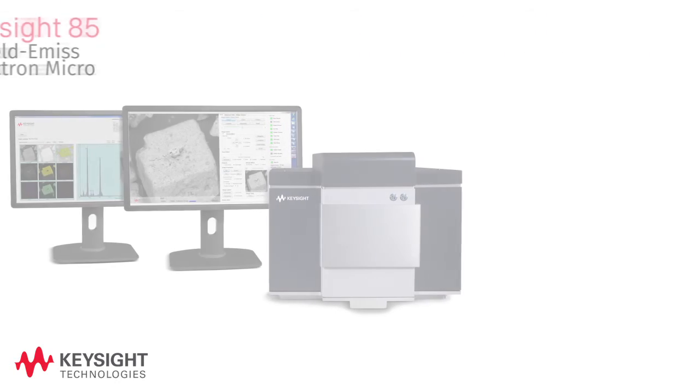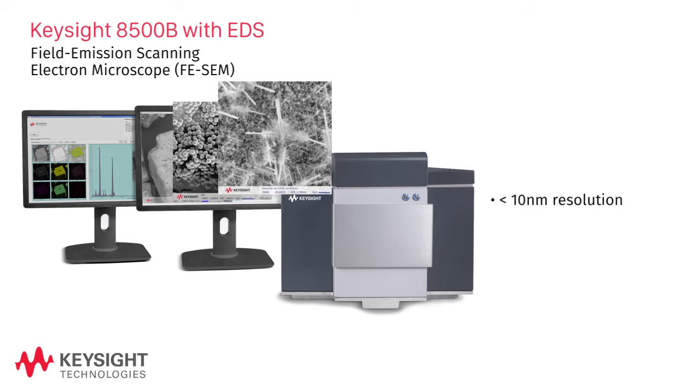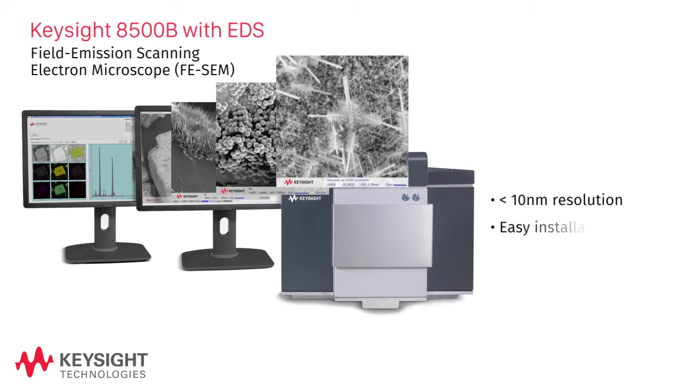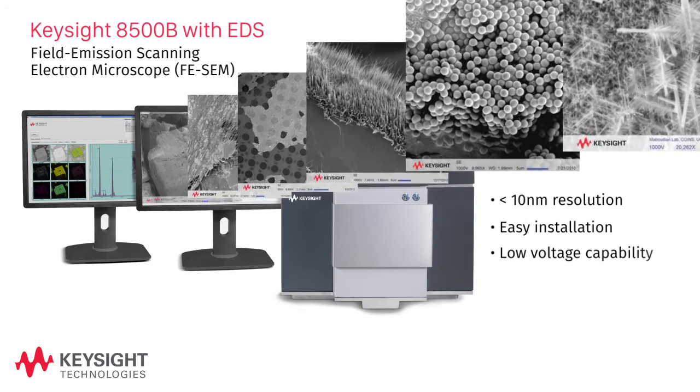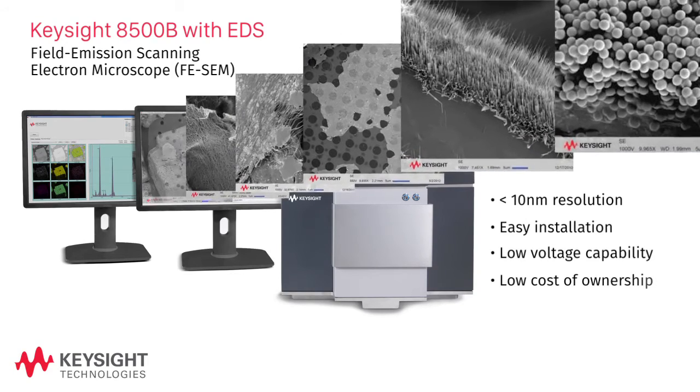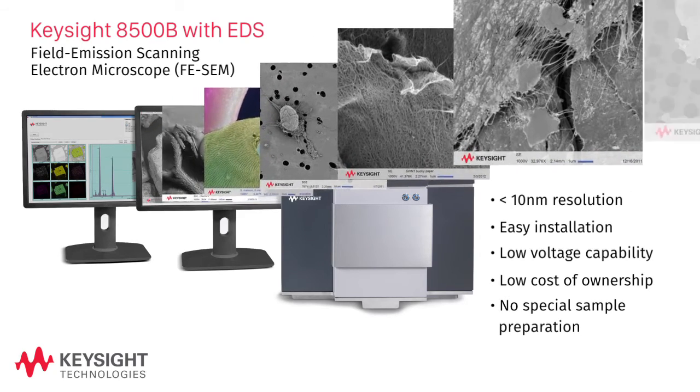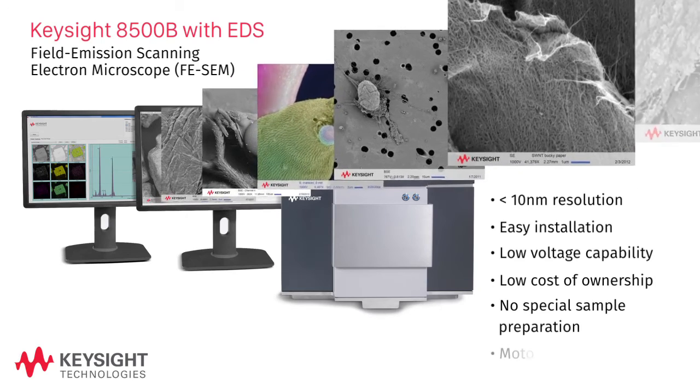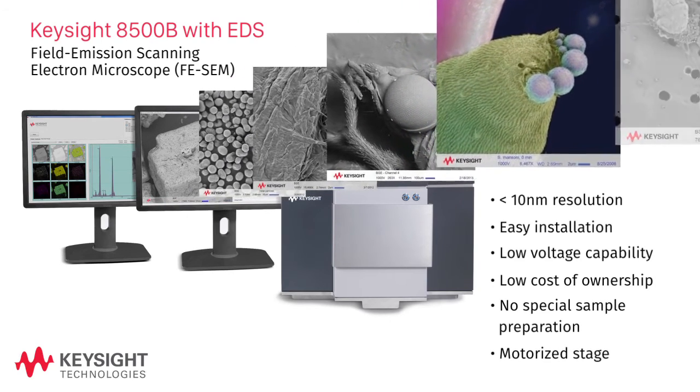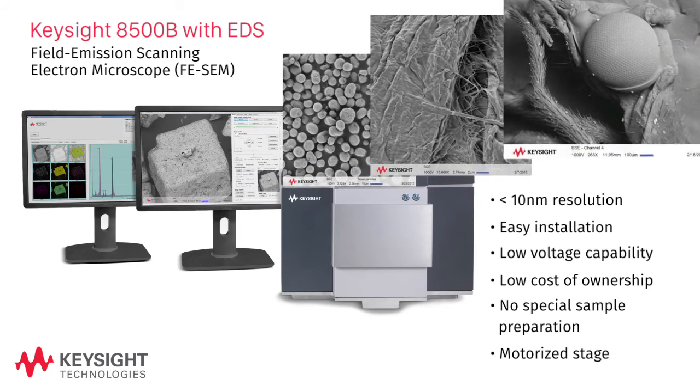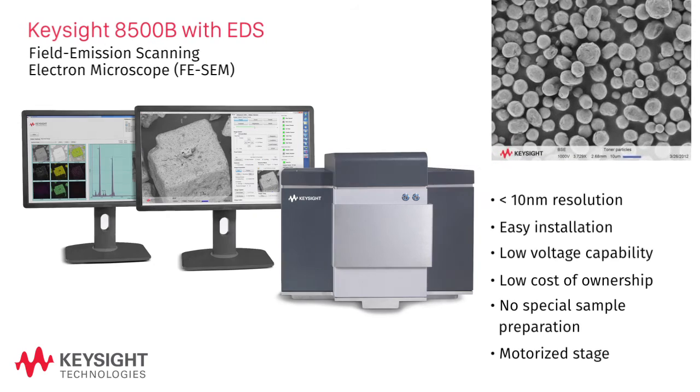The Keysight 8500B Compact FE-SEM offers less than 10 nanometer resolution, fast and simple installation thanks to a clever plug-and-play design, continuously variable low voltage for imaging energy sensitive samples, consistent repeatable performance with no special sample preparation requirements, with a motorized stage that lets you quickly transition from loading samples to getting data and now fully integrated energy dispersive spectroscopy capabilities for quantitative elemental analysis.